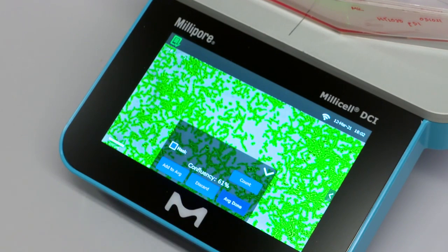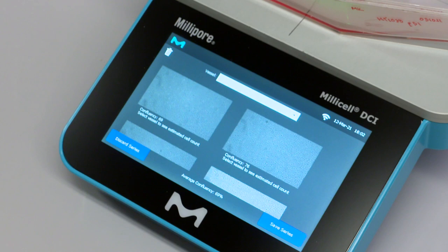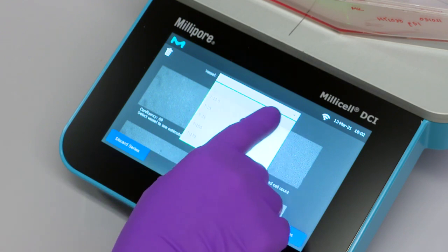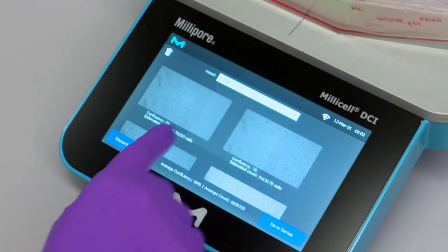You will be brought to a review screen where all images will be displayed. You have the option of selecting your vessel of choice from a drop-down menu in order to calculate the total estimated cell count.